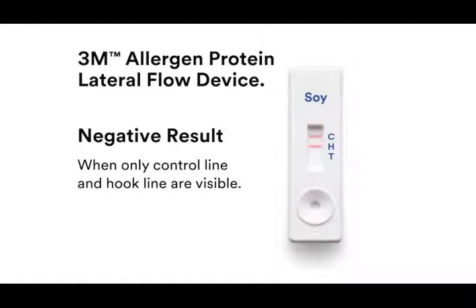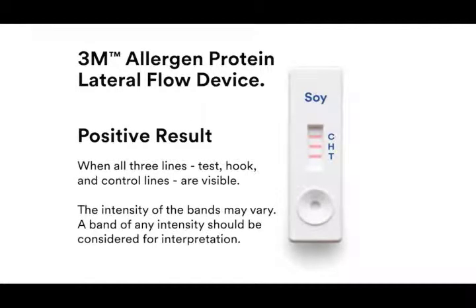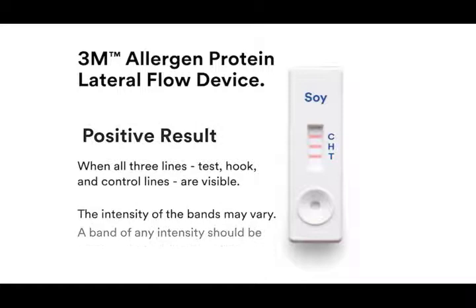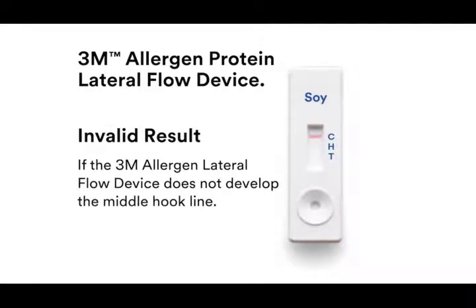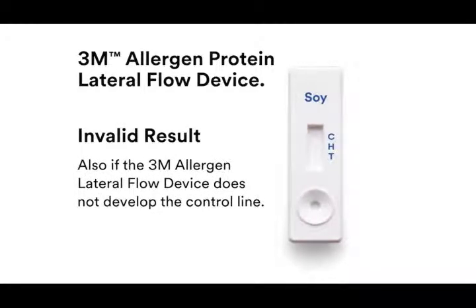A sample is considered positive when all three lines — test, hook, and control lines — are visible on the 3M allergen protein lateral flow device. A sample is considered invalid if the device does not develop the middle hook line; the absence of the hook line alerts you that the sample may be overloaded with allergen protein and the extracted sample needs to be diluted. A sample is also considered invalid if the device does not develop the control line.